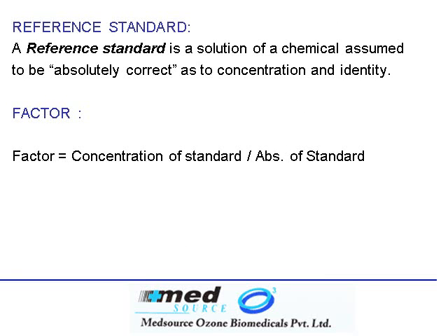Before we go further, one more thing that we must understand is, what is a reference standard? A reference standard is a solution of a chemical assumed to be absolutely correct as to its concentration and identity.